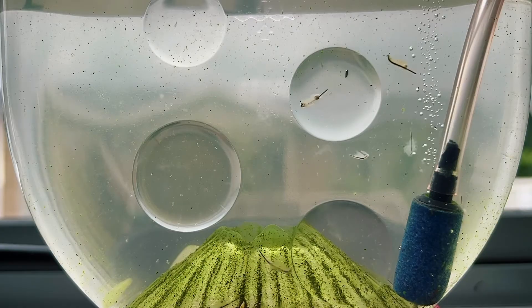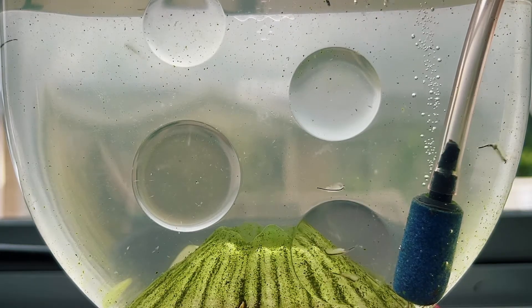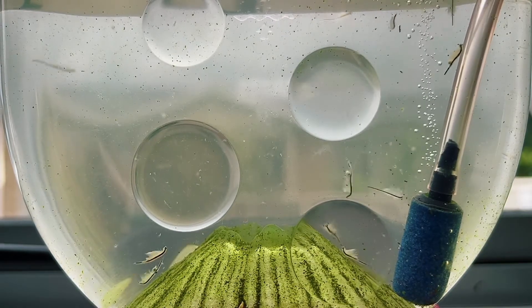This is a sea monkey ocean volcano tank that I started about a month ago and you can see that so far the tank is doing really well. There's a bunch of adult sea monkeys in there and a whole lot of second generation babies of varying sizes, so I thought it'd be cool to take a closer look at them under the microscope for today's video.